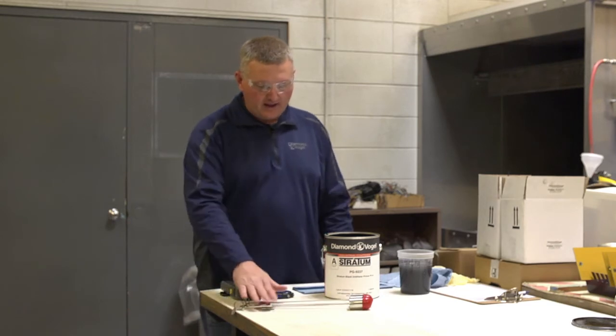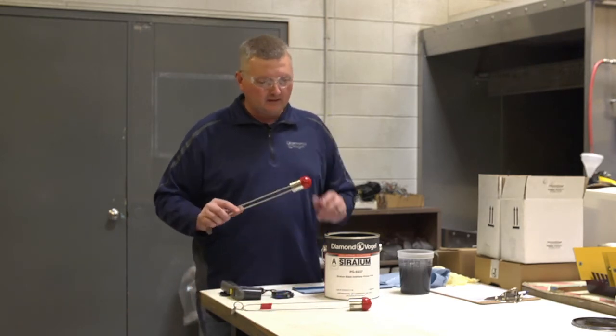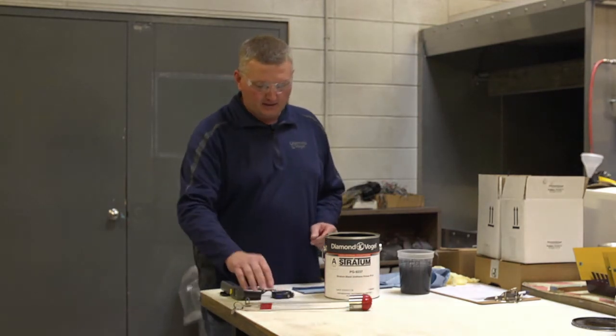These cups that I have are right at eight years old now, so it is possible to keep them clean. You always want to keep a protective end on them so that they don't get damaged.